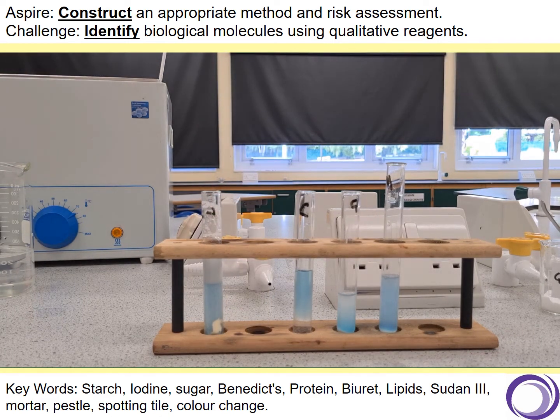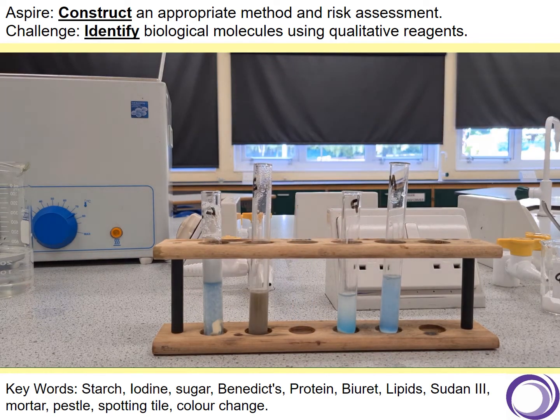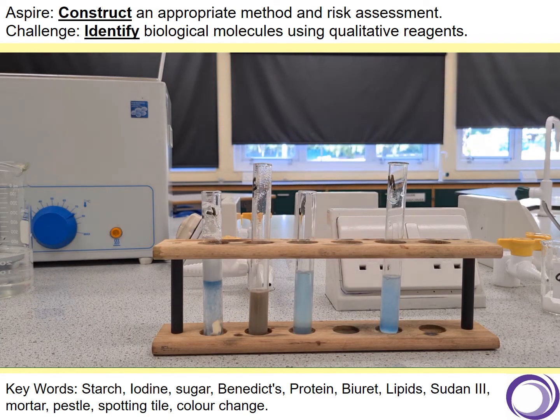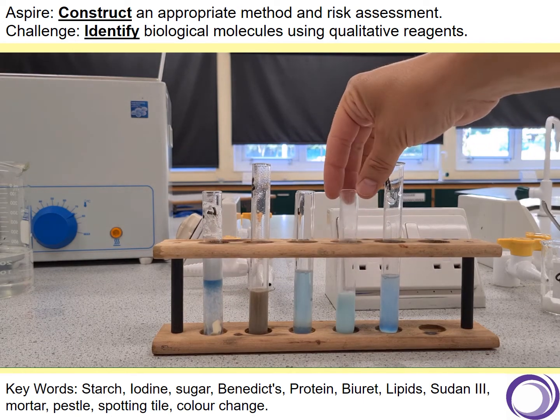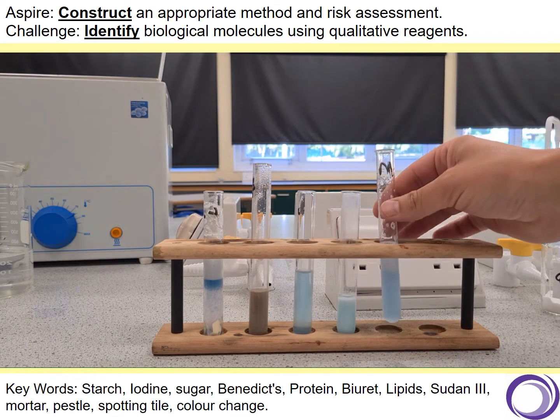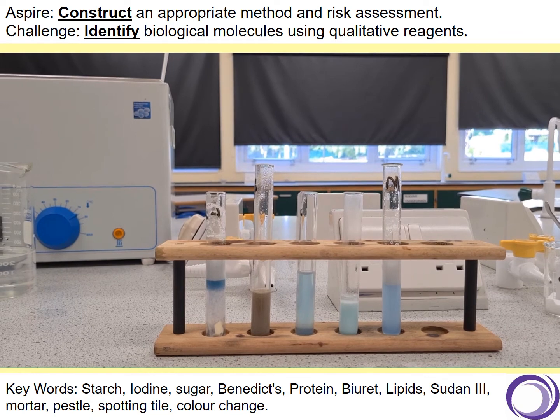Here's my protein shake one. Not convinced that one's going to work because of the colour of it. And the milk for the last one. Okay, and all I need to do now is leave them to see if there's any colour change.